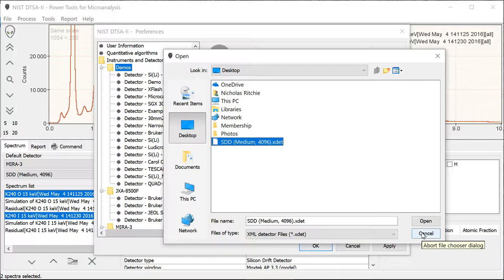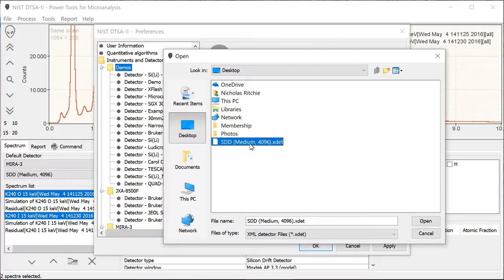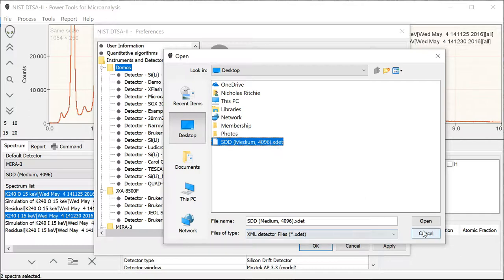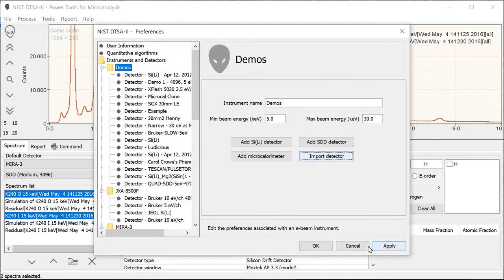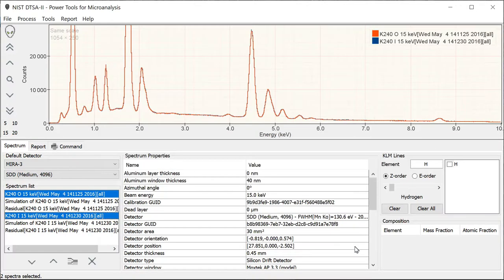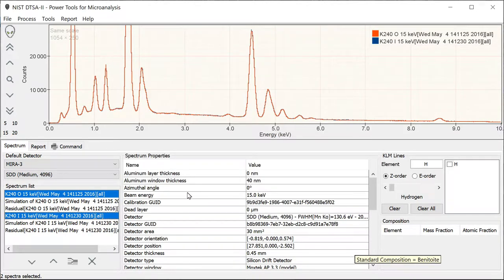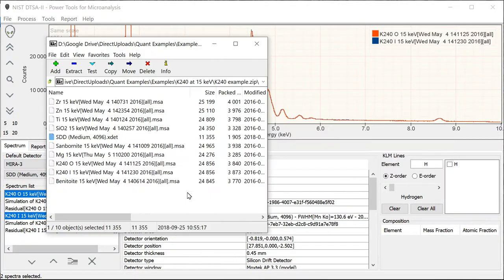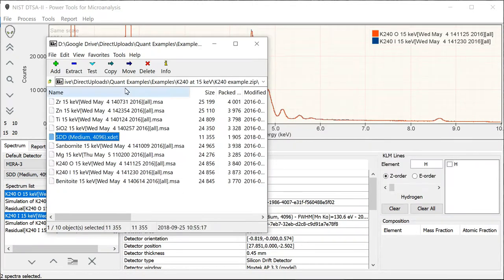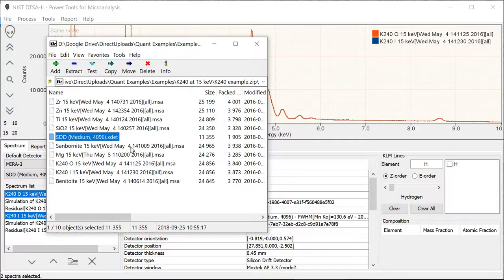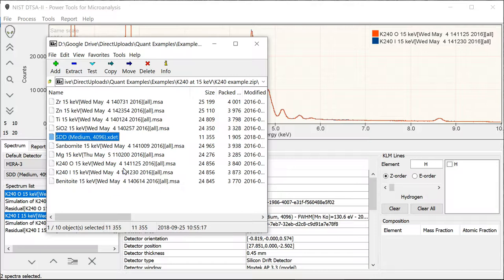You'll find one detector definition called SDD medium 4096, and that's the one that you should use to perform these analyses. I'm not going to do it because I've already got it in here, but that's what you would go ahead and do. And you would use these particular spectra. You can export them into a folder on your desktop or somewhere and follow along as I perform this quantification.